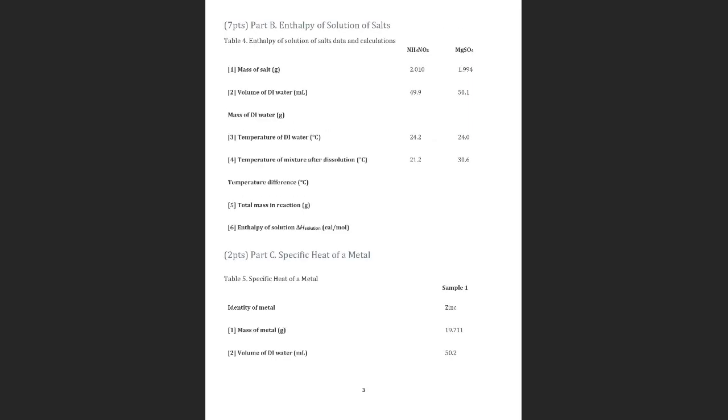Not much. So first, you have to complete this and the mass of water. What is the mass of water that you're going to add? Let's look at the previous one. Look at the data here. What is the mass of water that you have in your calorimeter? 49.9. Look at here. This is a different experiment. A, B, and C are three different ones. Oh, so you are in C. Okay. This is C. It's a different experiment.